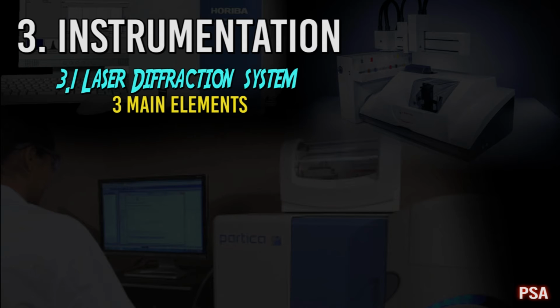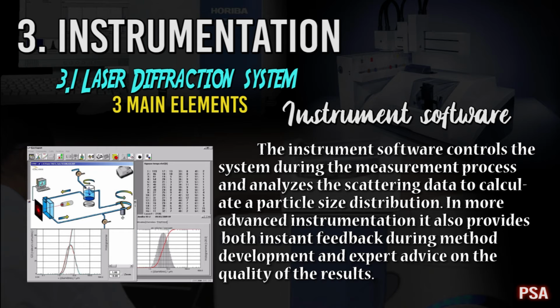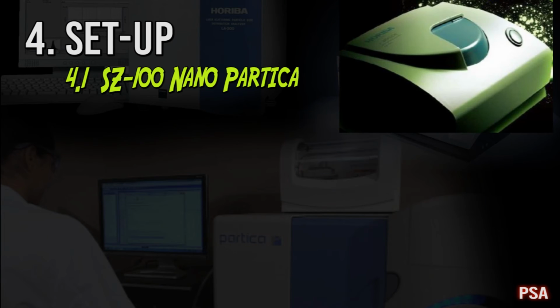And the last one is the instrument software. The instrument software controls the system during the measurement process, and it analyzes the scattering data to calculate a particle size distribution. In more advanced instrumentation, it also provides both instant feedback during method development and expert advice on the quality of the results.